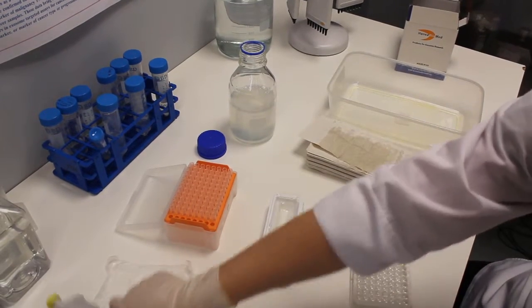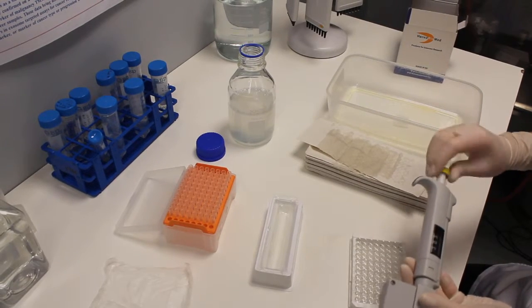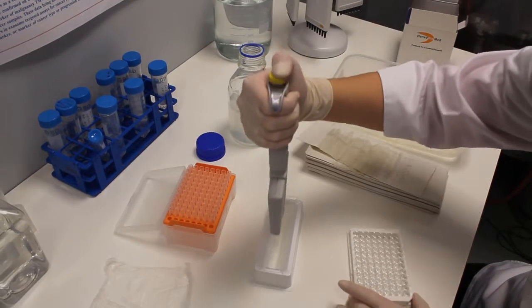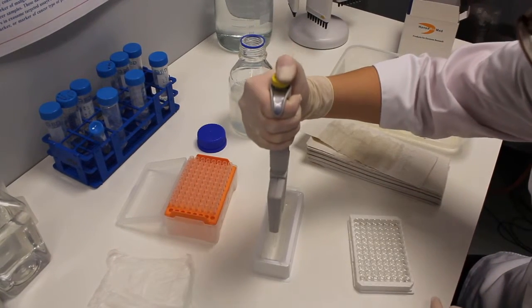Then add 300 microliters of washing buffer per well and discard the plate contents. Repeat this procedure twice again.